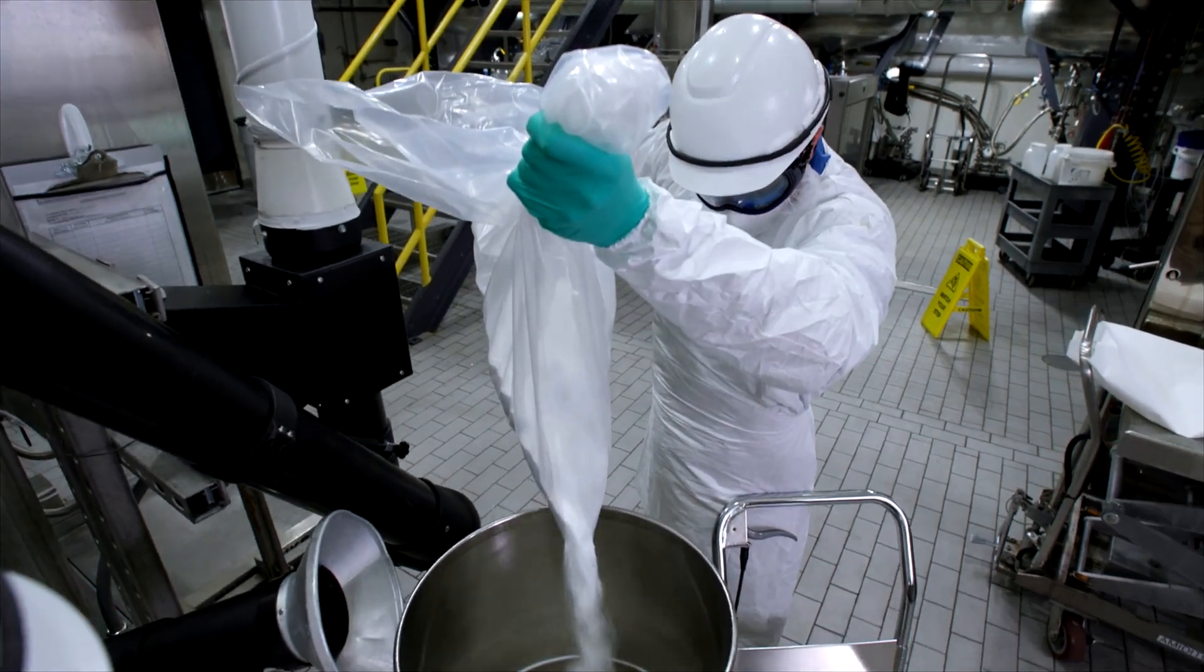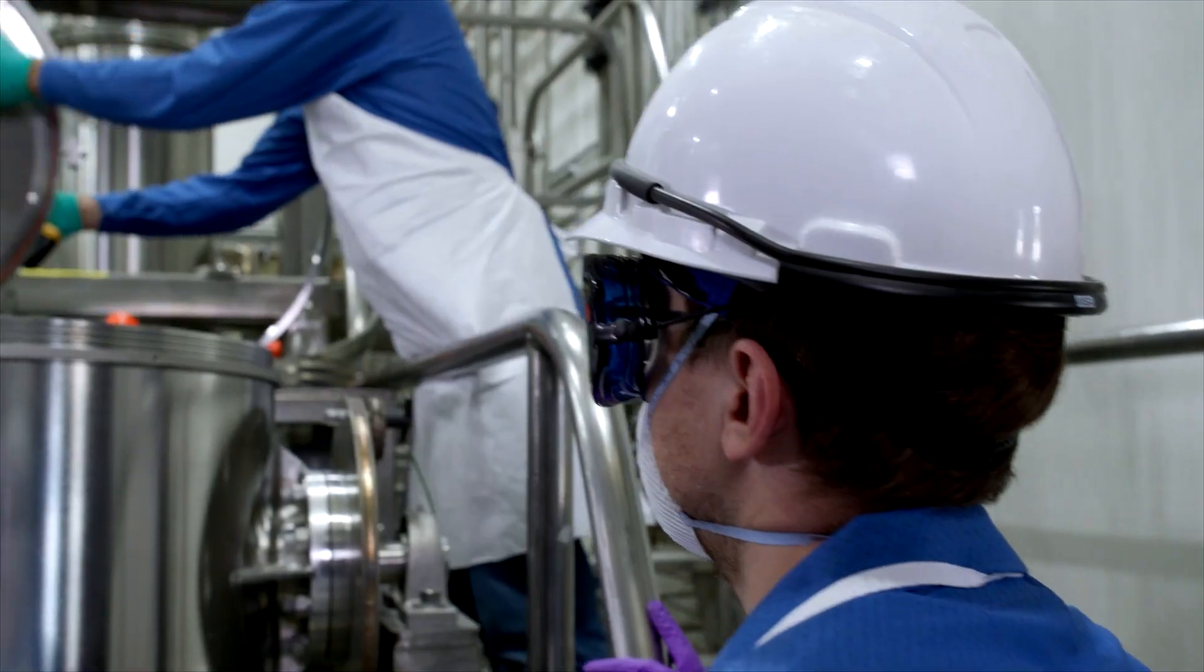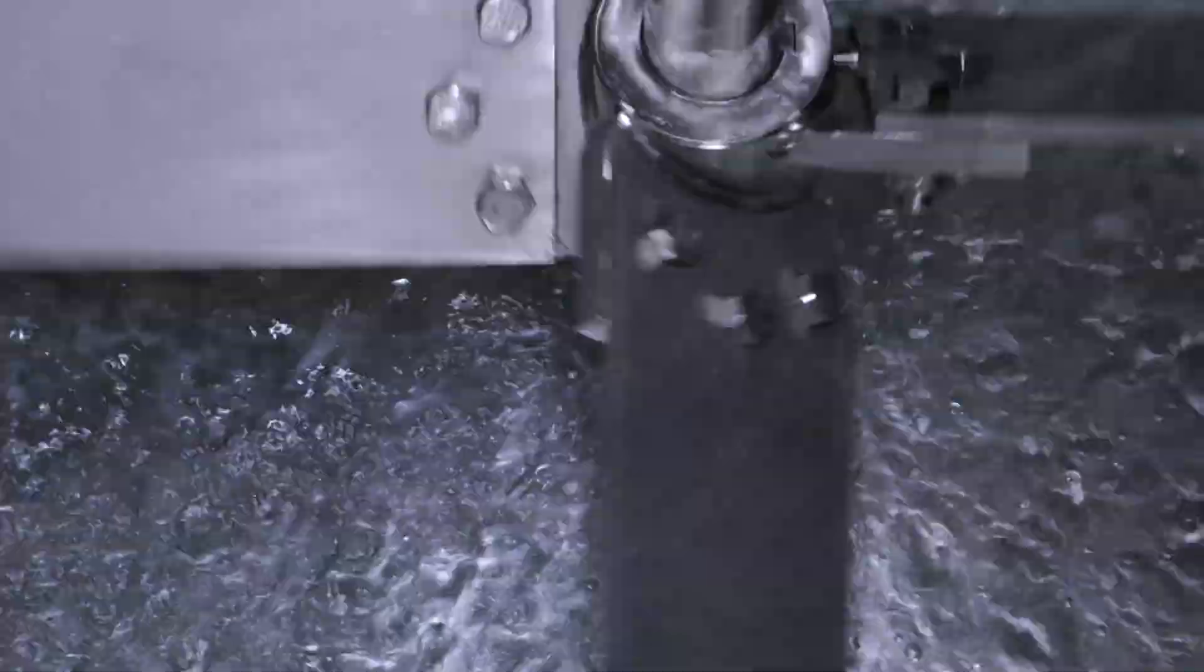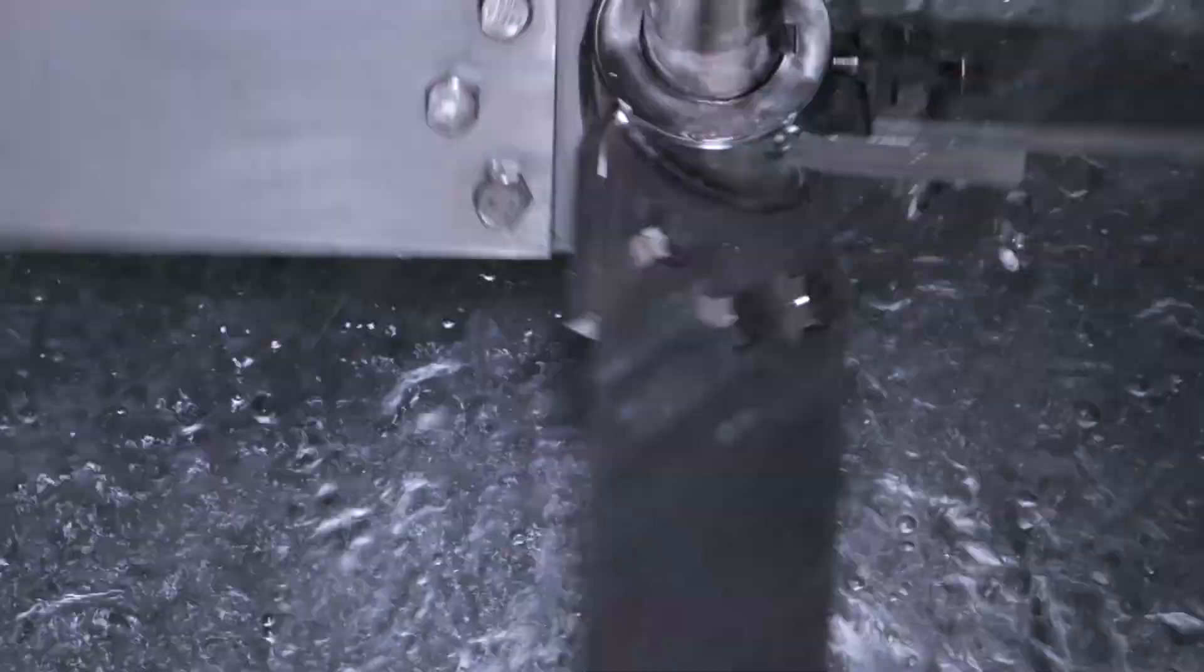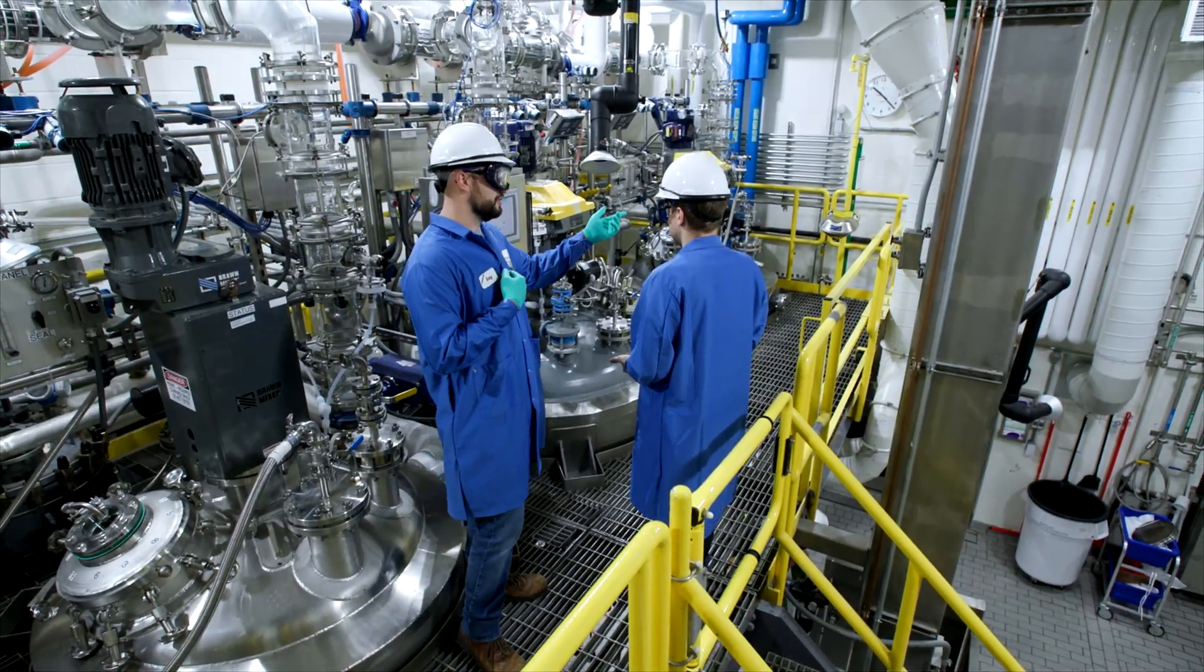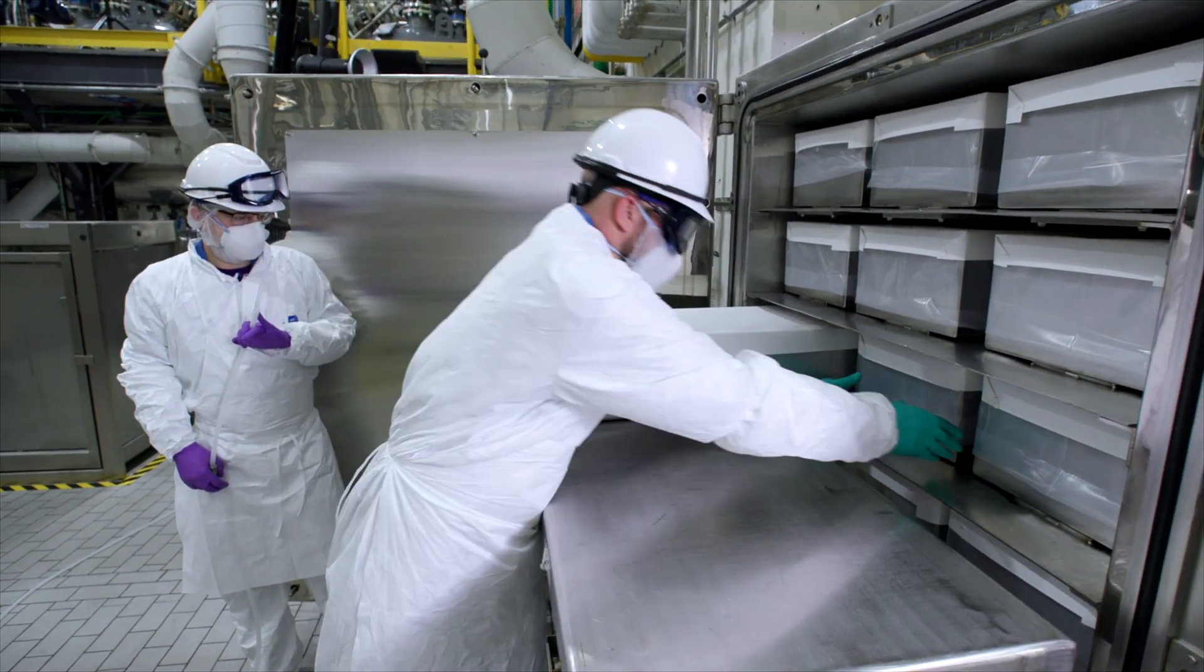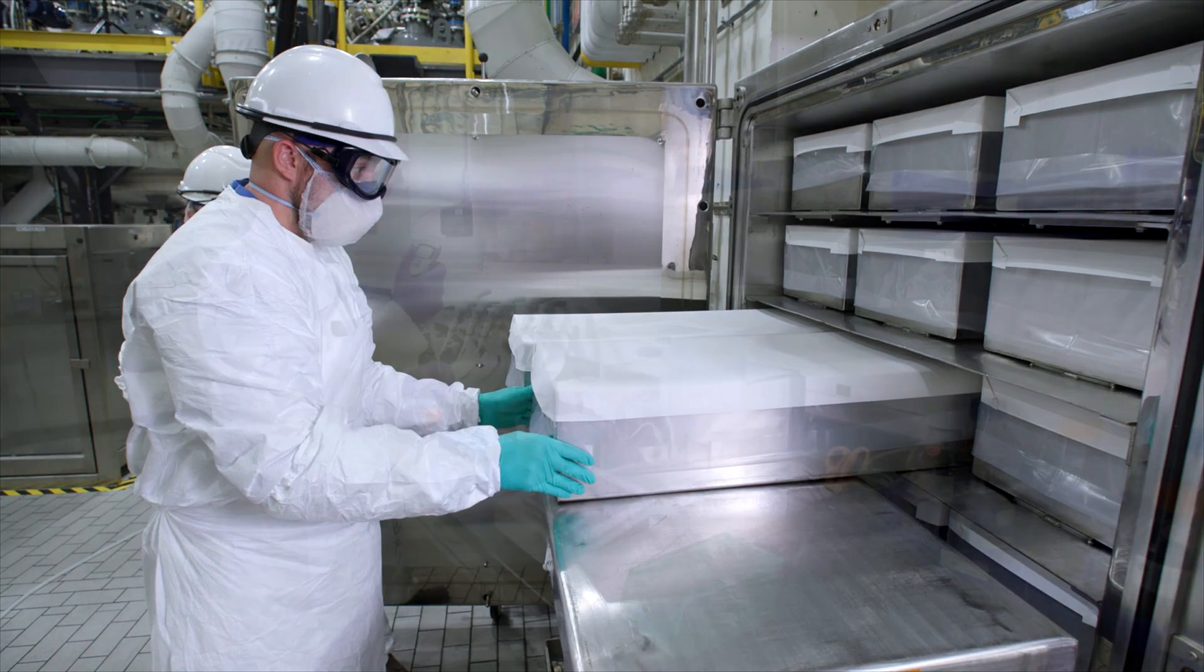To support emerging nucleic acid therapeutics, our manufacturing capacity of phosphoramidites was expanded more than five-fold in 2022. The expansion also enables us to serve you better with more safety stock on shelves for faster order fulfillment.